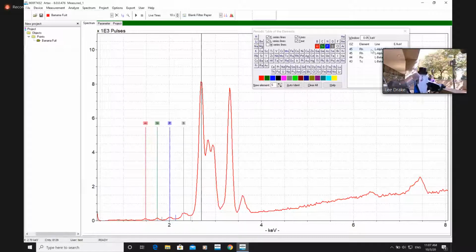And there's a number of ones you can use. For example, Niton uses silver. Bruker uses rhodium. There's different philosophies and advantages. Bruker tends to use rhodium because it's so rare that it's obvious to us that it's there. It's also in a nice sweet spot, so that way we know we're measuring something that we want to see. So in this case, we don't have to worry about rhodium, but we're always going to see it. That said, rhodium tells you a lot about your sample. The more rhodium feedback you get, especially the incoherent scatter of rhodium, that tends to tell you there are more light elements like carbon and oxygen present in your sample. So this right here is rhodium.